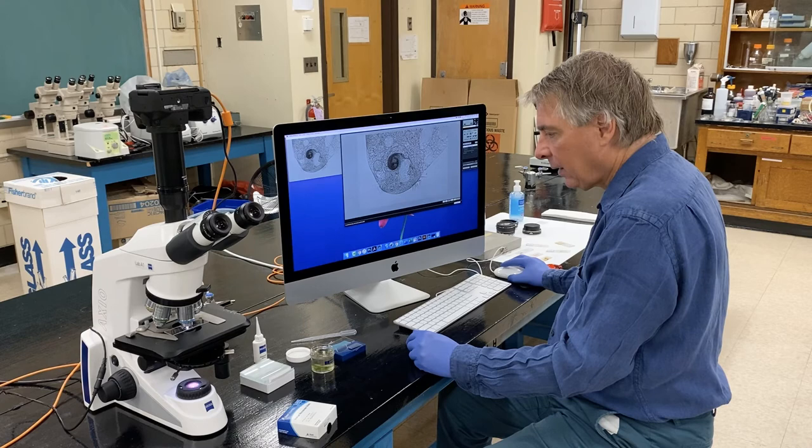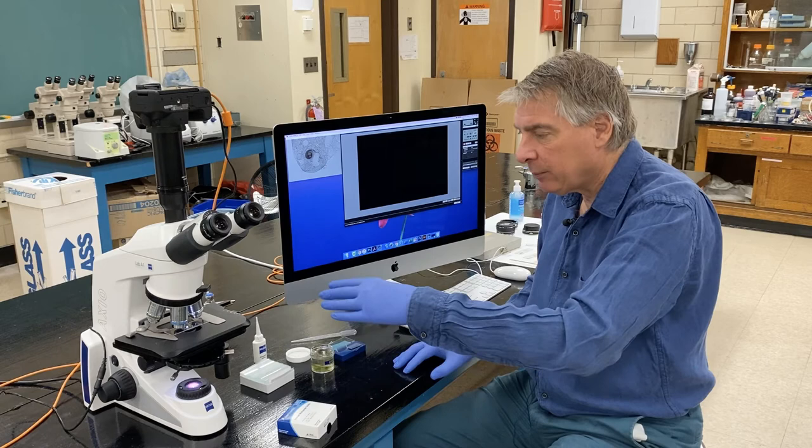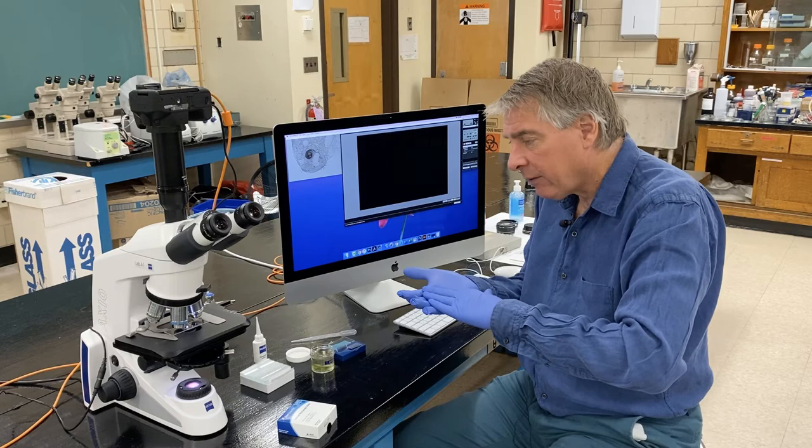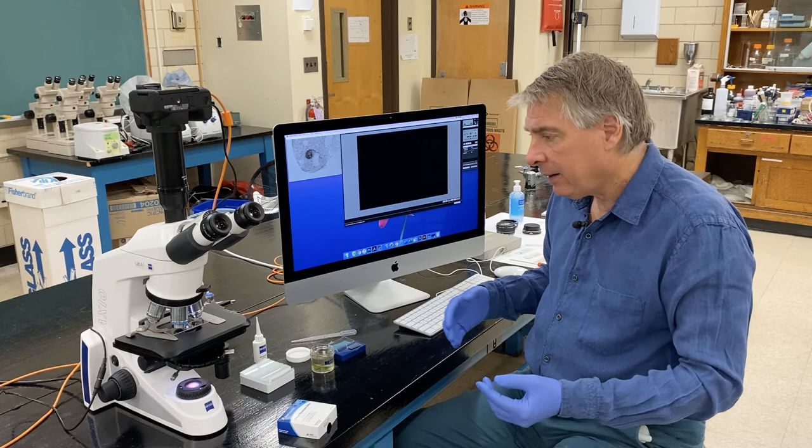Okay, now if I want to go up to 100x, I have to swing out the 40, put the oil on, and then swing the 100x objective in place such that the oil fills the entire space between the cover slip on the top side of the cover slip and the glass of the microscope objective. Once I shoot it at 100x, I take the slide off and I throw it away.